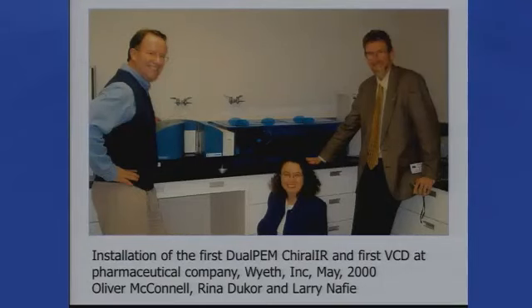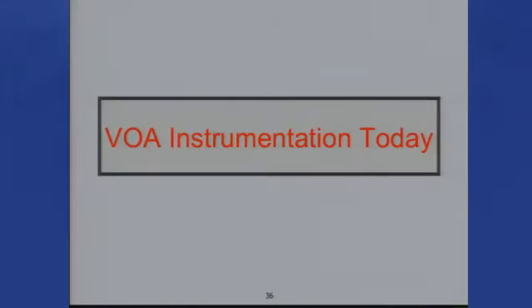So this is the first installation of VCD in a pharmaceutical company, and then they went right to the dual PEM setup. This is at Wyeth with Oliver McConnell, who was an administrator there and not a spectroscopist, and he went on to do his own VCD calculations, and so was really happy to have that instrument.